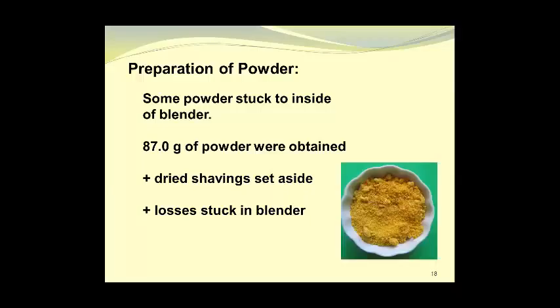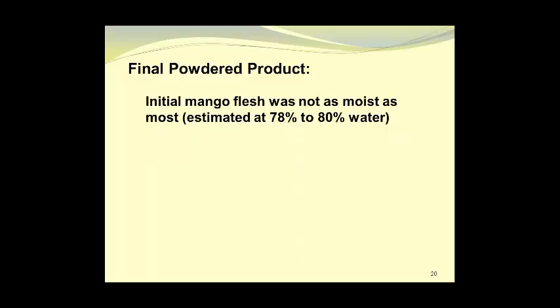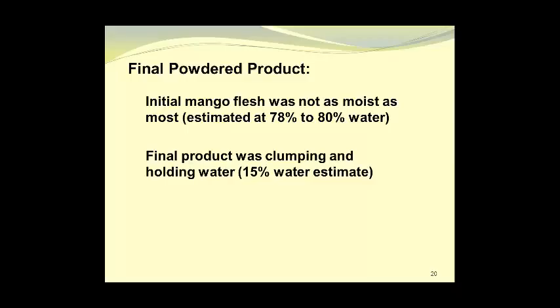Here we see the powder in a small white dish, and you can observe some of the clumping. The material was quite hygroscopic — meaning it absorbed moisture from the air — and it clumped together as well as sticking to the blender and bowl surfaces. The initial mango flesh was estimated to have a moisture content of 78 to 80 percent, and the final product was clumping and holding water, so it was probably around 15 percent moisture.